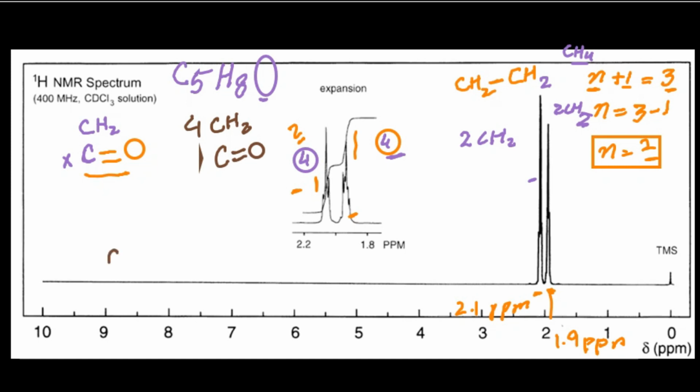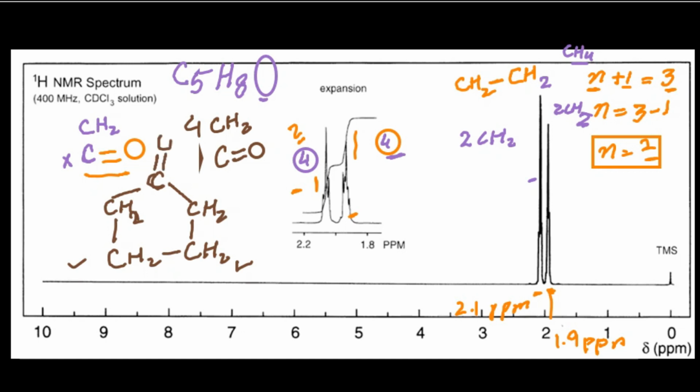It is very simple. CH2 groups are always attached to each other to satisfy their valency. As you may see, this carbon's valency is satisfied, and this carbon has also satisfied valency. Now the problem is that these 2 carbons have one valency less. As you know, there is also another carbon. Now these 4 carbons have satisfied valency, but this carbon's valency is not satisfied. So if we attach this with the oxygen atom, now all the 5 carbon atoms have satisfied valency.